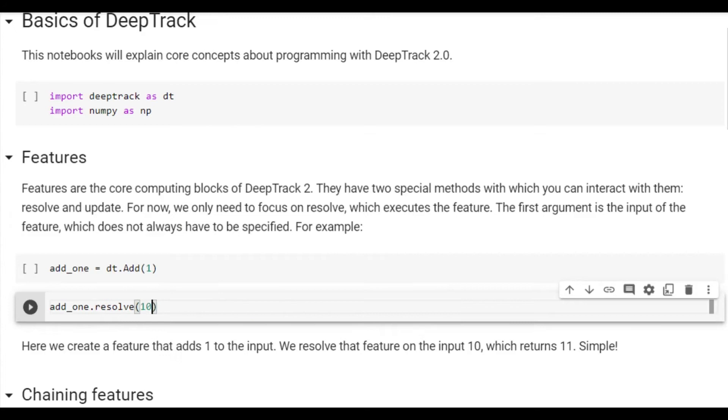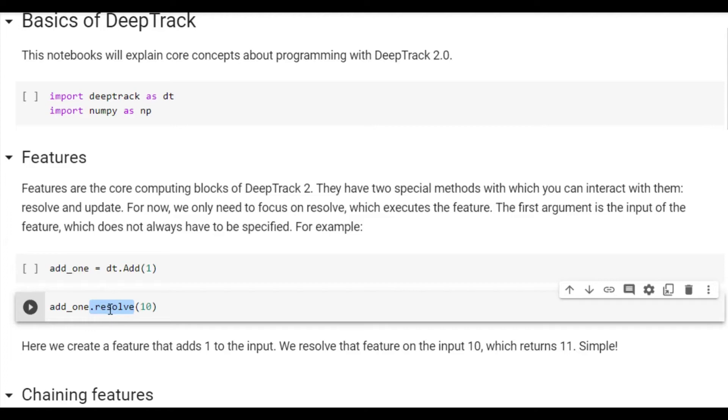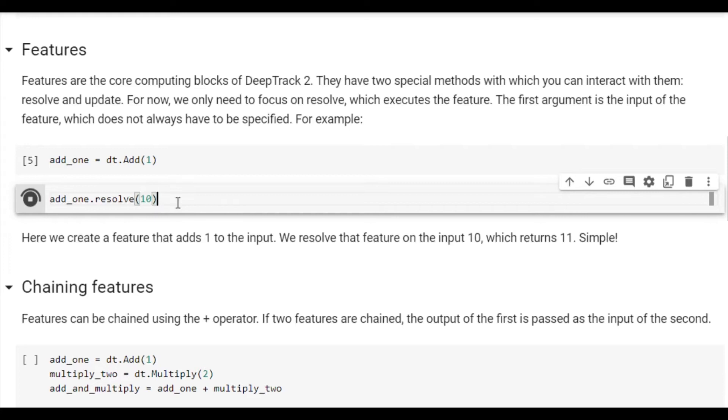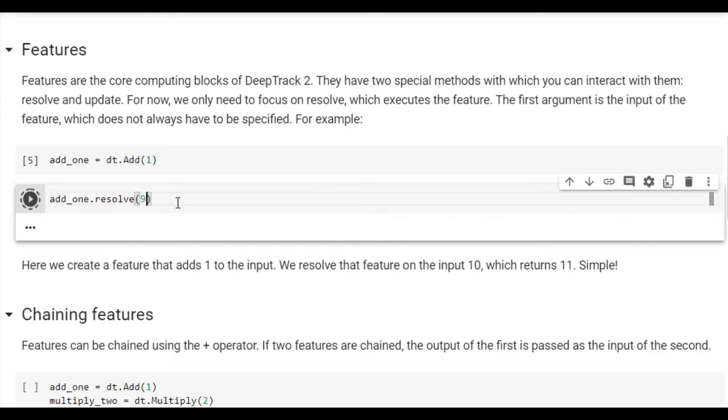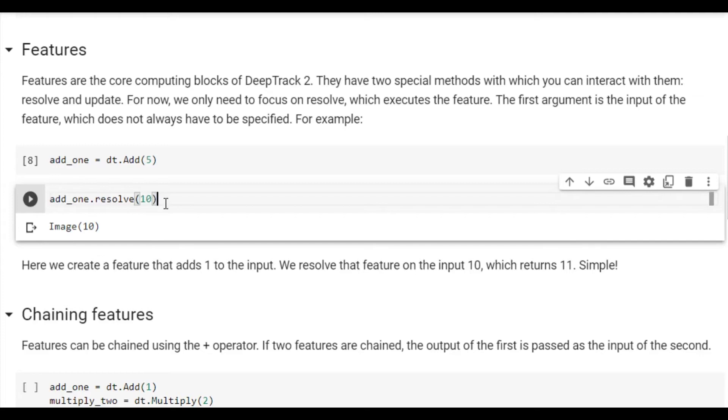Here we have a notebook which explains features in a simpler but more abstract way. Here we have an add feature which simply adds a value. But to what? Well, that is determined when it is executed. We execute it by calling the method .resolve. The first argument is then the input. So for example, if we execute the add1 feature on the input 10, we get 11. In a similar way, if we execute it on the input 9, we get 10. We can also change the argument of the add feature, for example, to 5. We then get 10 plus 5 is 15.